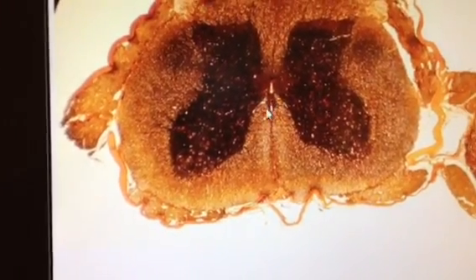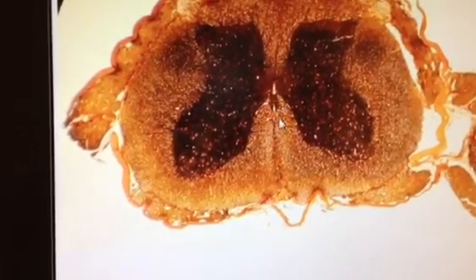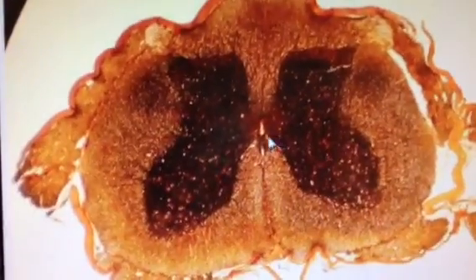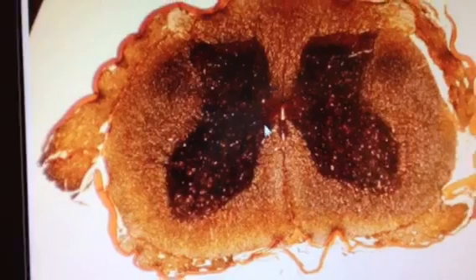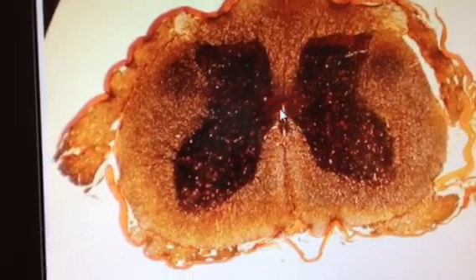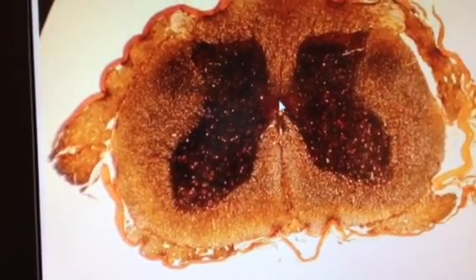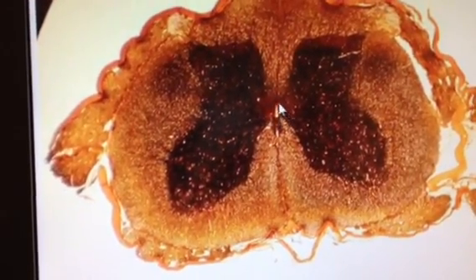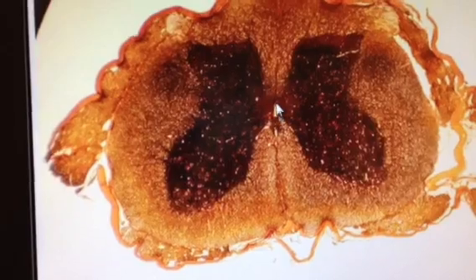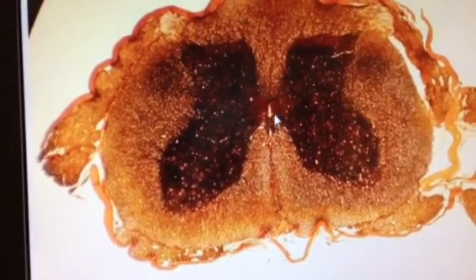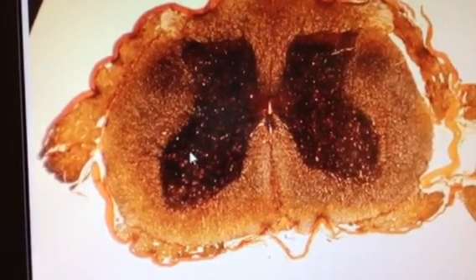Within the central canal, we can see ependymal cells — supportive neuroglial cells that support the circulation and flow of CSF through this area.